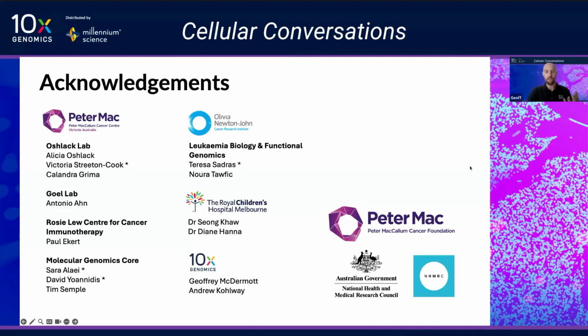So there is a question from Wei Shi, who asked, and I'm happy to help jump in with this answer too. Sorry, it's hard to read this. Is it possible to detect fusion circular RNAs, either using Flex or the spatial transcriptomics platforms from 10X as well?